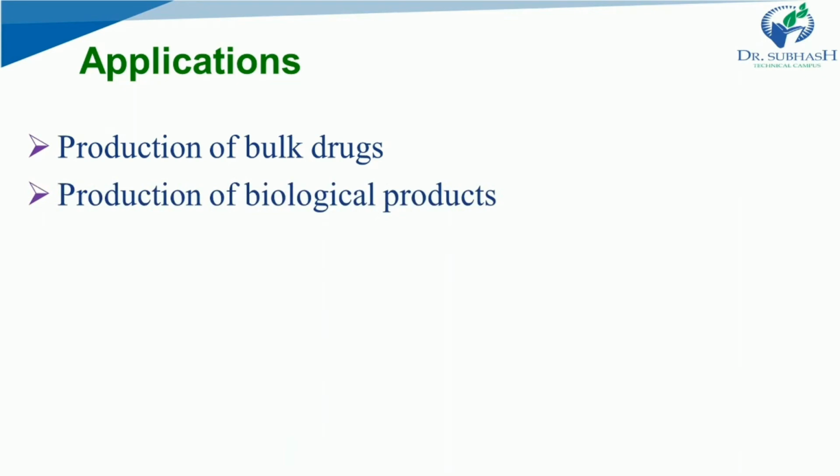The second is production of biological products. Most of the protein drugs and macromolecules are present as a colloidal dispersion in water. By normal methods, it is very difficult to produce them on a large scale, but centrifugal methods are useful for preparation of these types of components. Insulin can be obtained in pure form by selectively precipitating other fractions of protein and subsequently separating them by ultracentrifugation.